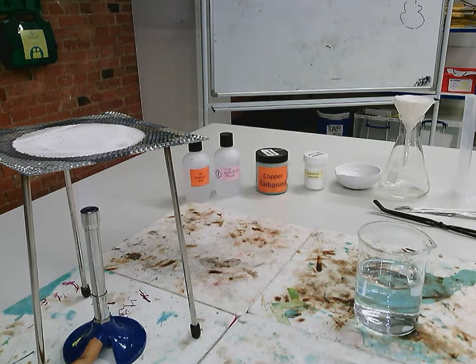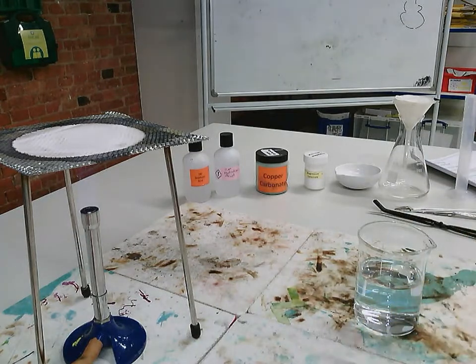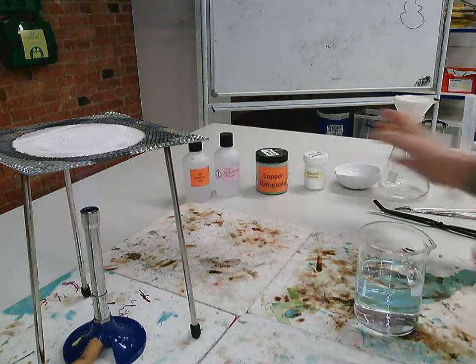Okay, this is a video for the required practical making copper sulfate crystals. So as part of your required practical, you have to make copper sulfate crystals, and they give you a range of things to do that.